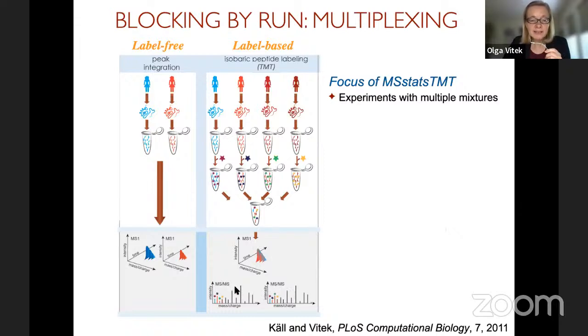And on one hand, we now have multiple MS/MS spectra, and you can imagine that the reporter ions, which are part of the same MS/MS spectrum, share some similarities. They're more similar to each other than reporter ions which belong to different MS/MS spectra. For example, if an MS/MS spectrum was sampled close to the apex of the MS1 peak, these intensities will be higher.